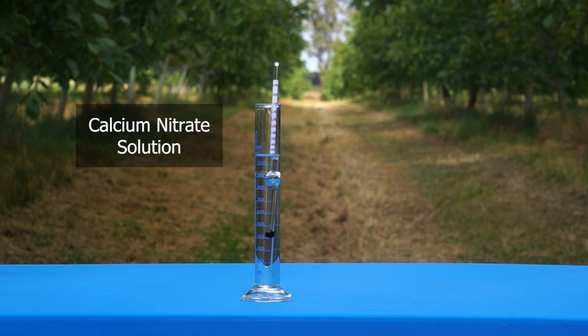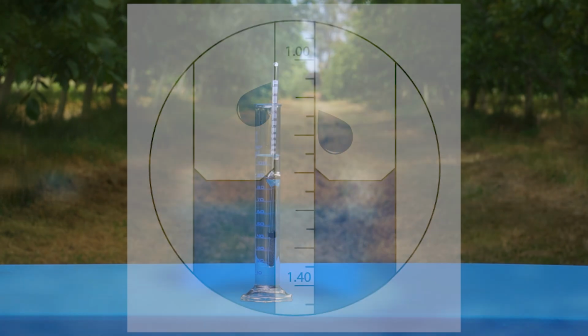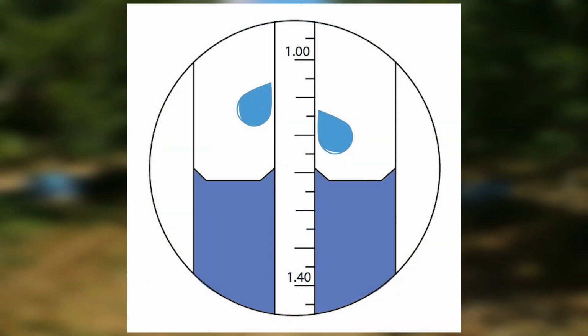Next, check that there is enough liquid in the measuring cylinder so the hydrometer can float freely when placed in it. If there are any air bubbles trapped, give the hydrometer a quick spin to release them. If sample liquid is splashed onto the hydrometer stem, wipe it off. This can artificially lower the SG reading, especially for heavier liquids, as it weighs down the hydrometer.